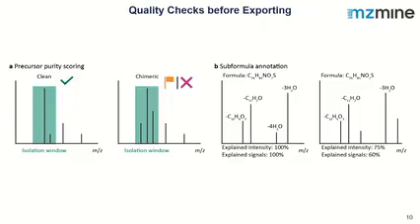And also, if you think about complex samples, there's always a high chance you will generate chimeric spectra in the end. So it's also good to just keep it, and you know there is information, but also additional information for something else.